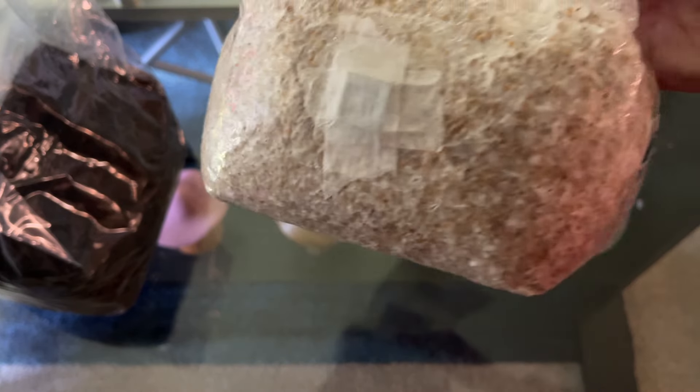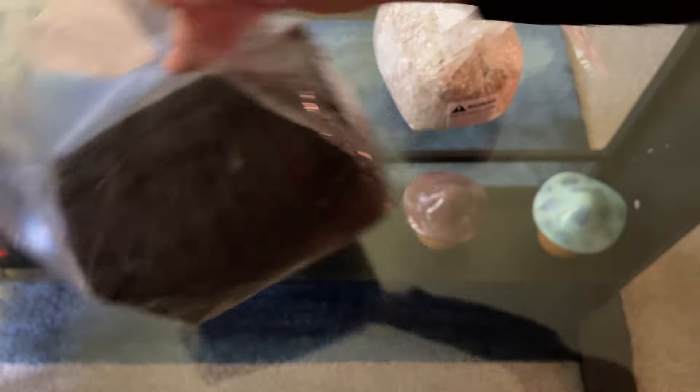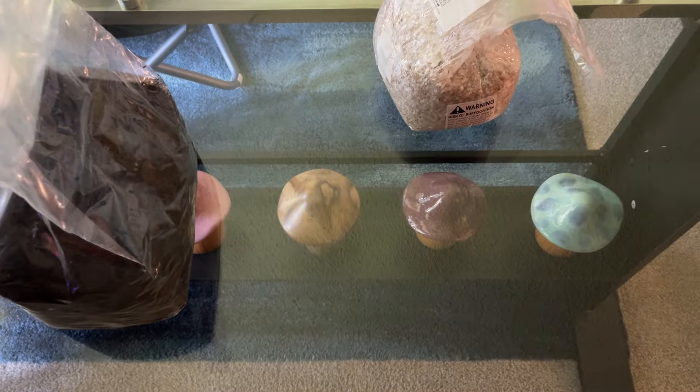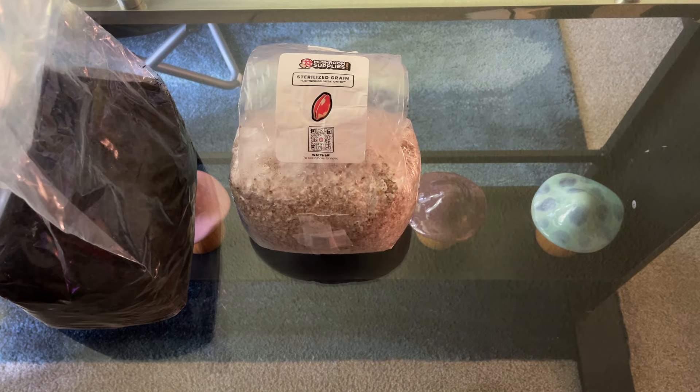We have a three-pound colonized grain bag here as well as a five-pound bag of manure-based substrate. This is already sterile, so you don't have to worry about pasteurizing it — but we will cover that in future episodes. The last thing we're going to need to spawn to bulk is a liner. You don't necessarily need one; it is more of an optional thing, but it is best to use to avoid side pins.